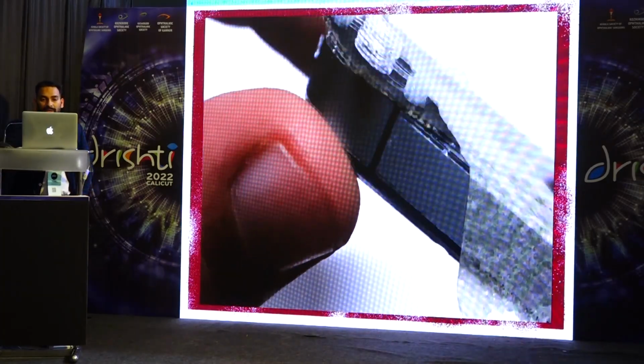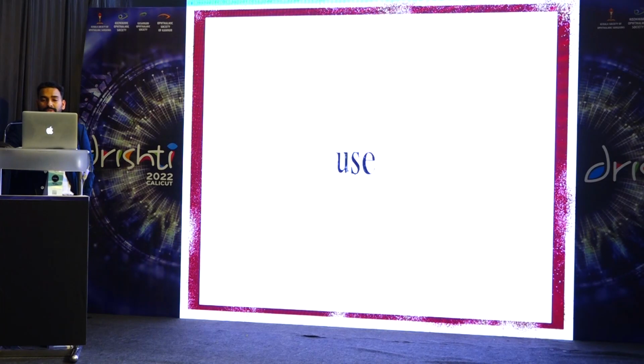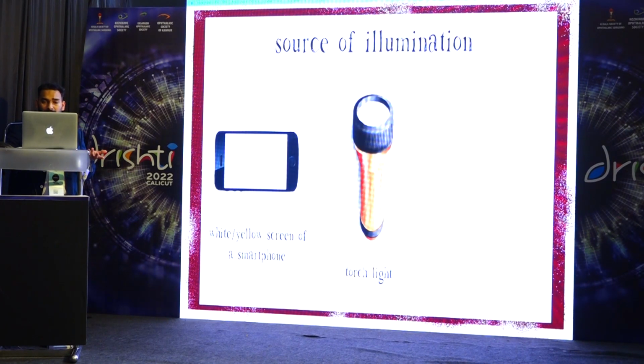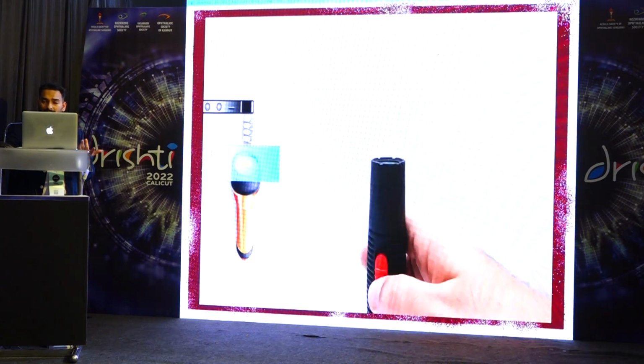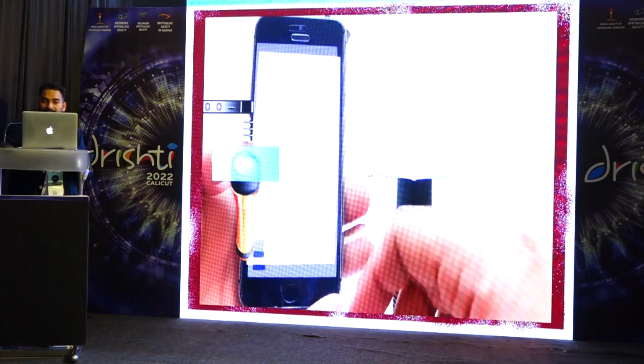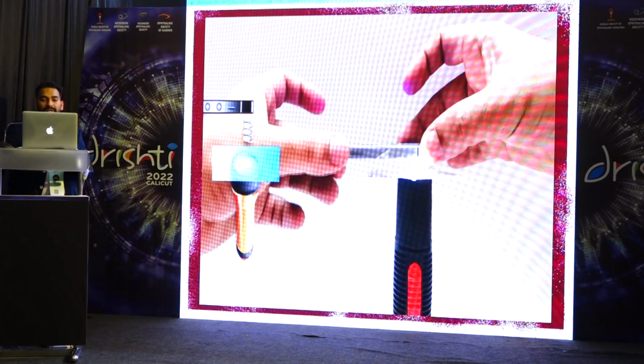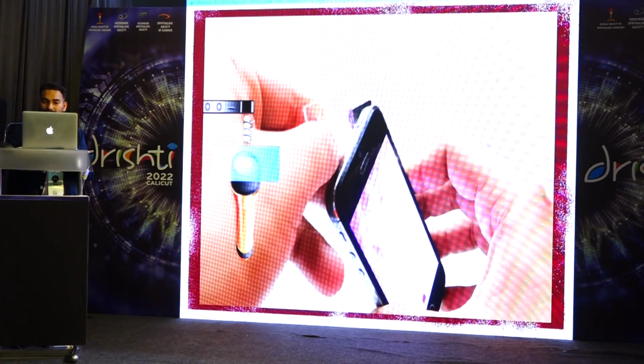Yeah, and then you'll require an illumination device. You can use a smartphone or a torch or direct sunlight. Here is a demonstration on torch. You keep the slide, whichever you want to image, and this way you can take images of microorganisms.